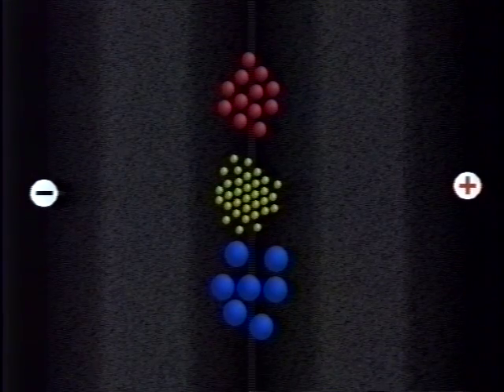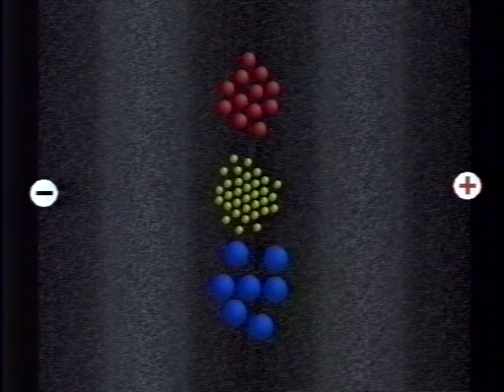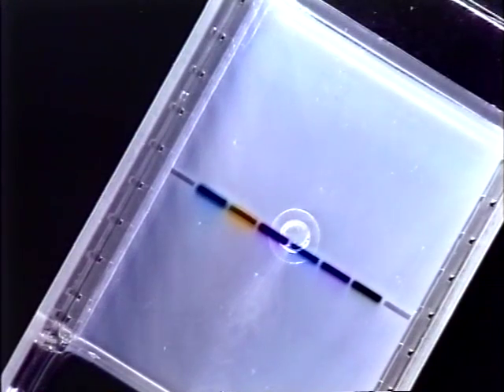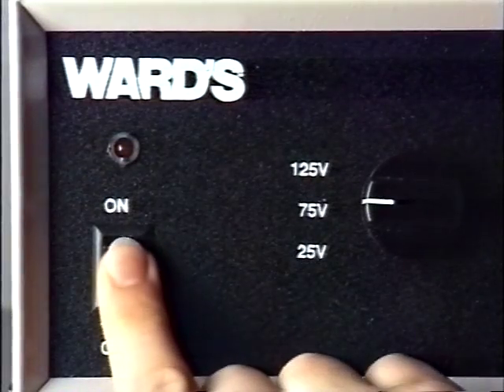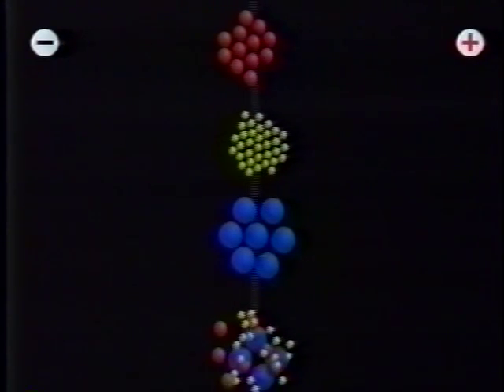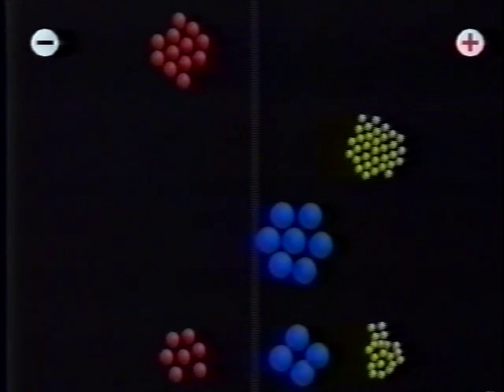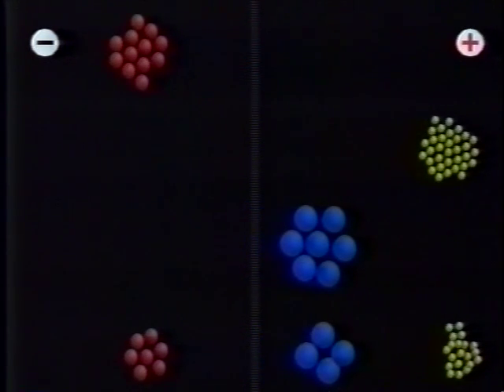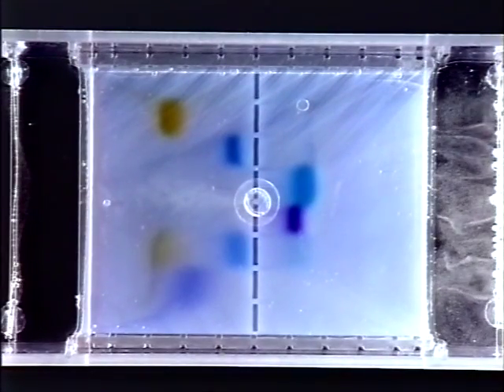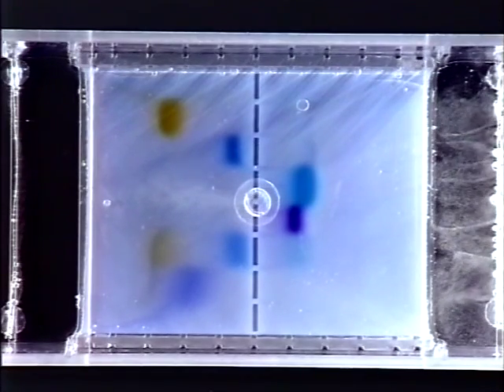The gel itself exerts a frictional resistance, acting as a molecular sieve to separate the moving macromolecules. Various dyes and a dye mixture show how this works. Energize and the molecular race begins. The smaller molecules will migrate faster and so travel farther. Turning off the power will stop the molecular migration. The dyes have separated as predicted, with the smallest macromolecules racing ahead and the largest barely making it off the starting line.